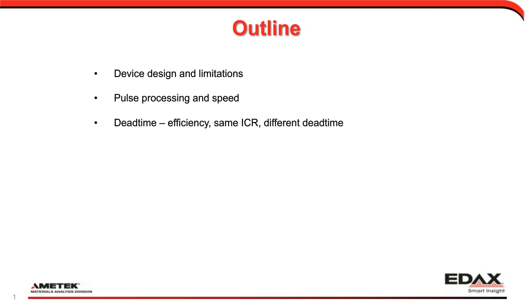One of them being a nickel titanium sample and a titanium aluminum vanadium sample, where we'll be looking at the quant numbers for the minor constituents, the aluminum and vanadium. Then I will go through a little bit of low energy and high speed at the same time, which also has a few practical limitations. And then we have a quick summary at the end of everything.